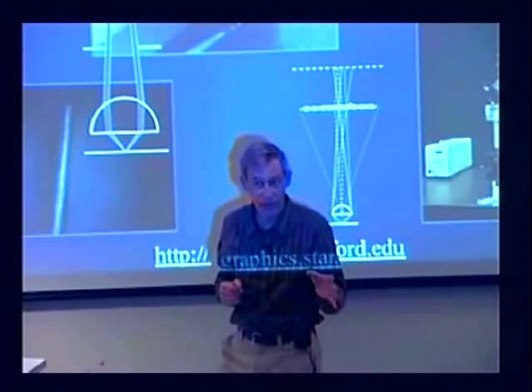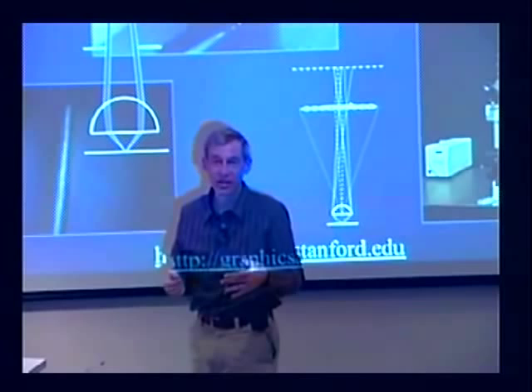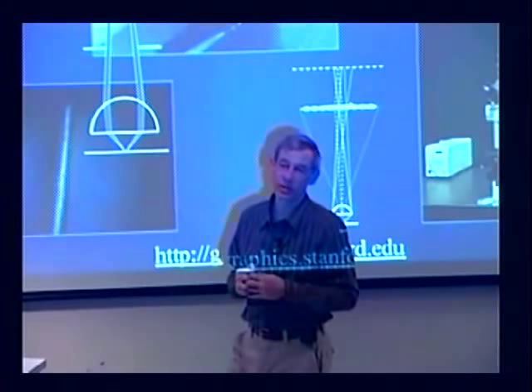For opaque objects, a sequence of images would allow you to do three-dimensional reconstruction using, say, a shape from focus algorithm. And from that, you could then render anything you wanted to. So indeed, the focus does give you information, but it's non-robust or potentially ill-posed algorithms that are being used to do that reconstruction. So it's not an easy problem.